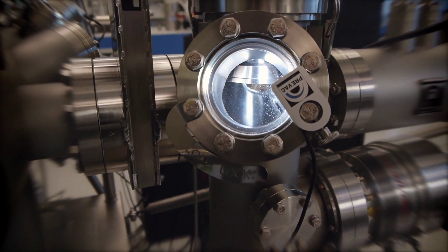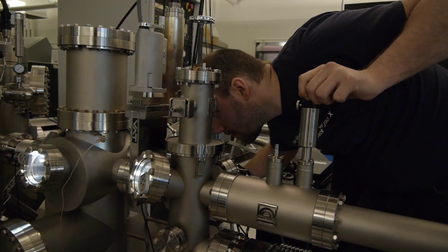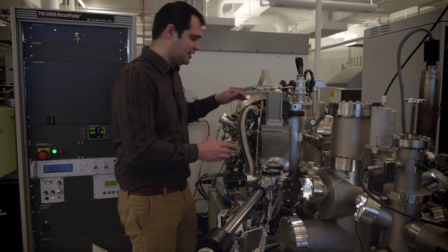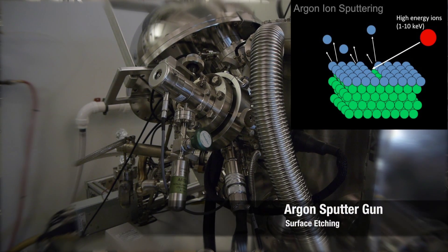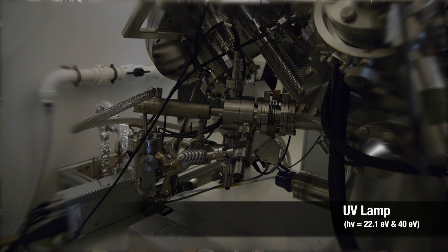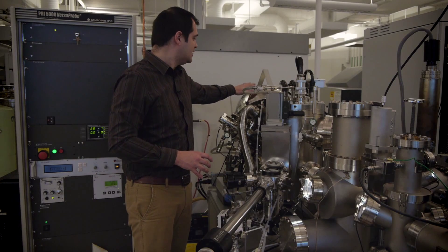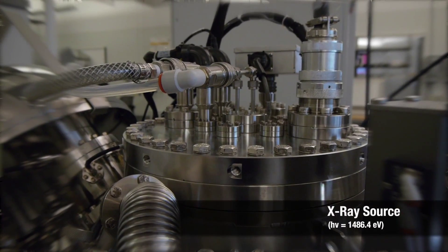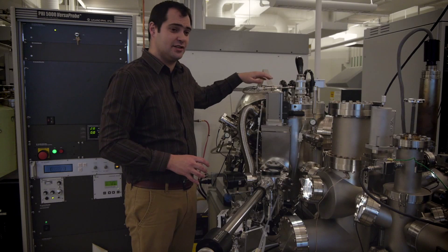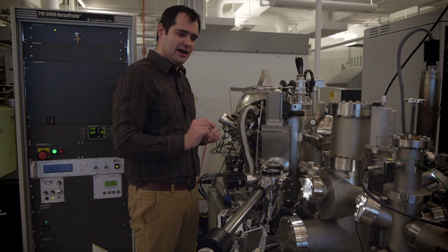We also have a separate load lock system so we can load samples independently into the surface preparation chamber without affecting experiments in the main chamber. The main chamber consists of both a depth-profile sputter gun, a UV source, and an X-ray photoemission analyzer, which has its characteristic hemispherical shape. Up top, here are our controls for our X-ray source, which is an aluminum K-alpha. This chamber is monochromated so we can ensure a small source of incident radiation.